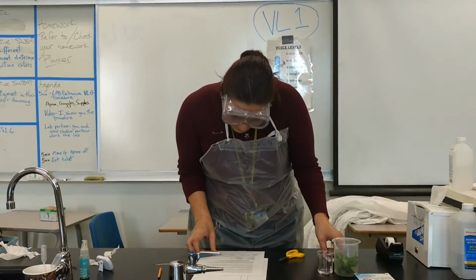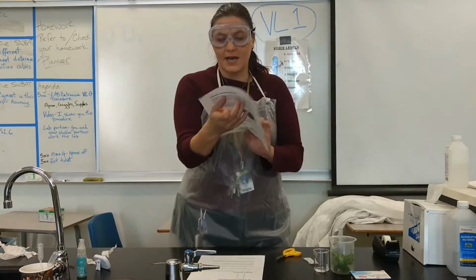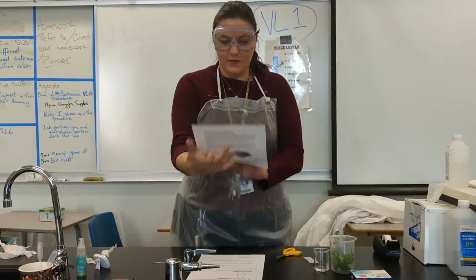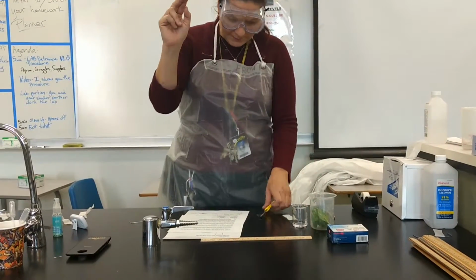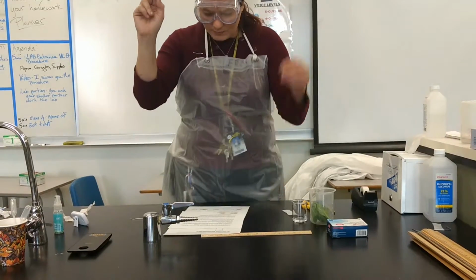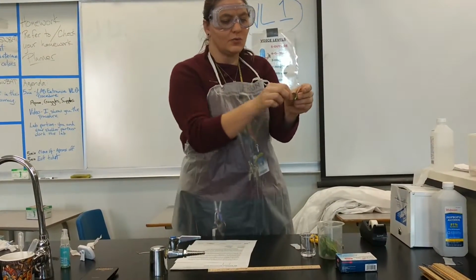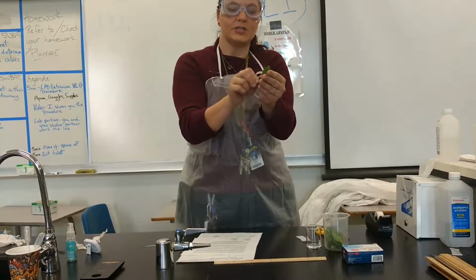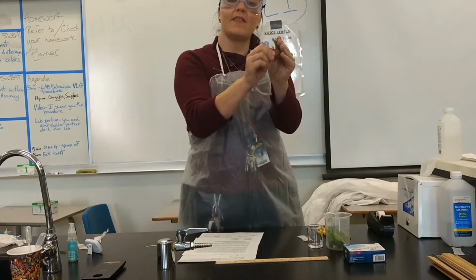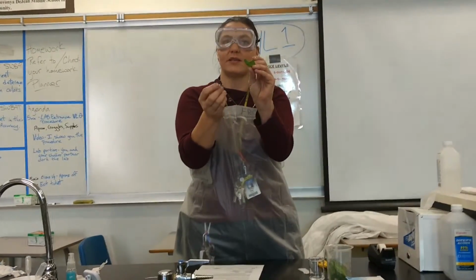Thank you. All right. The next check mark, if you flip your page over to the second side, is the spinach leaf over the baseline. So what I'm going to do is take my spinach leaf and my penny, my coin, and we're going to do a roll action, which is rolling across. The other action that people will try and do is this, and that doesn't always get the pigment or the extract out of the leaf. It just tears the leaf.